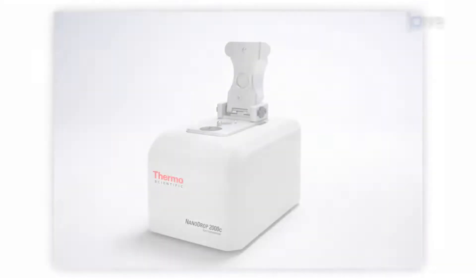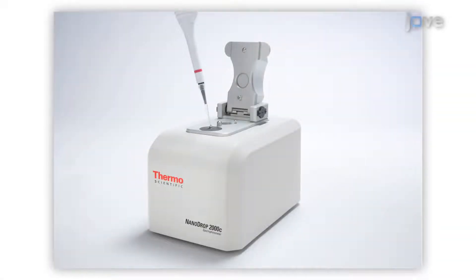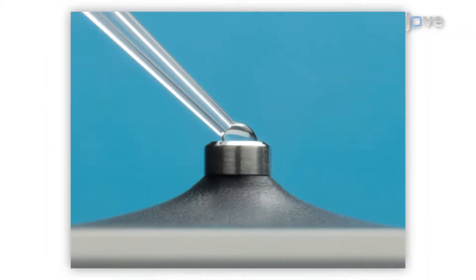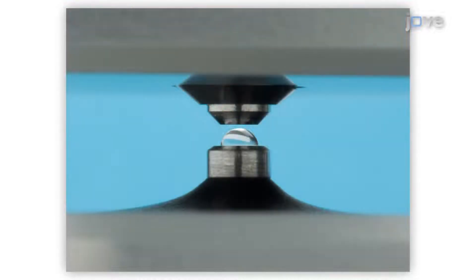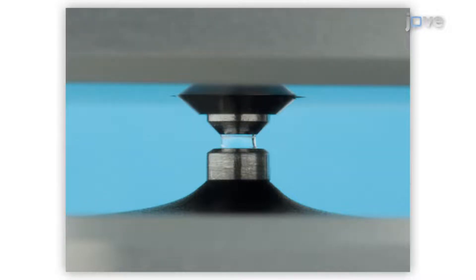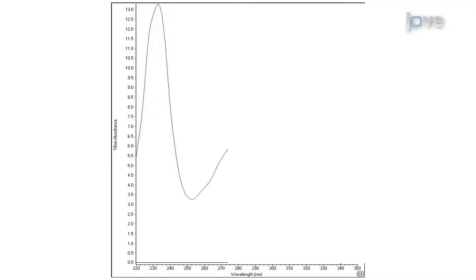Nanodrop technology combines fiber optics and surface tension to hold and measure small amounts of samples, such as nucleic acids and proteins. A small droplet of sample is pipetted directly onto the lower pedestal. An upper optical pedestal then engages the sample to form a column. The pedestal automatically moves to adjust for optimal path length. Shortening the path length eliminates the need to perform dilutions for most protein samples. Measurement occurs in seconds and UV-Vis spectrum results are displayed.